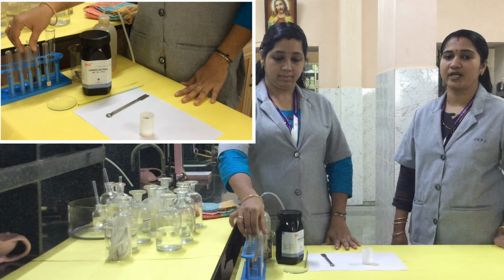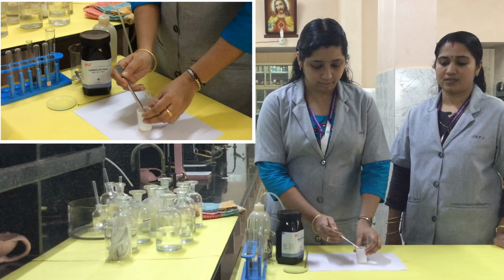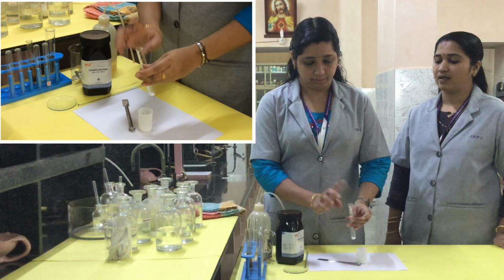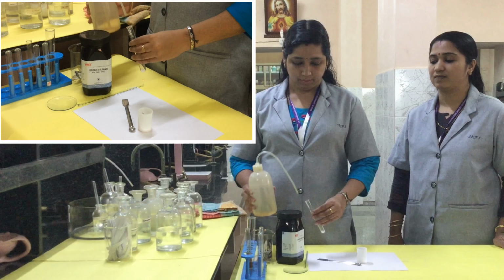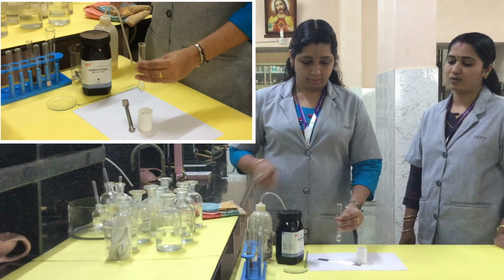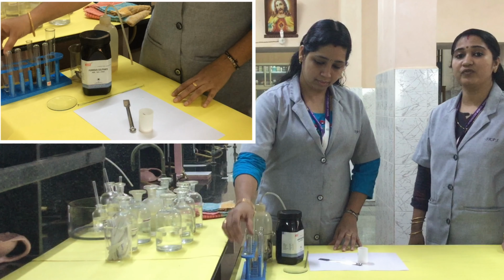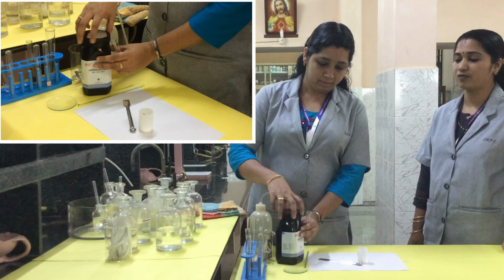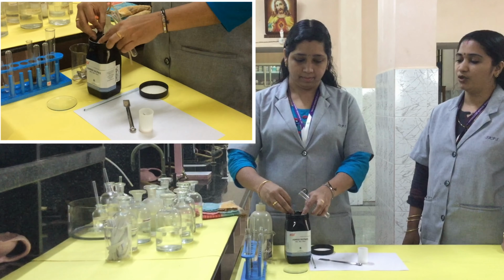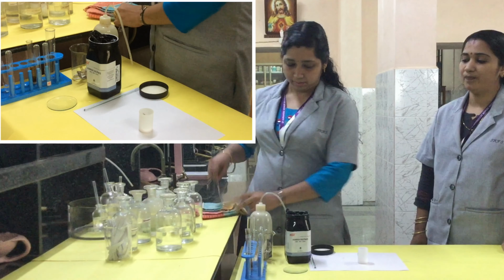Confirmatory test for nitrate: the brown ring test. For that, take a little of the salt in a dry test tube and make a solution of the salt. Keep it aside. Then you have to prepare freshly prepared ferrous sulfate solution for this brown ring test. For that, take solid ferrous sulfate crystals in another dry test tube.